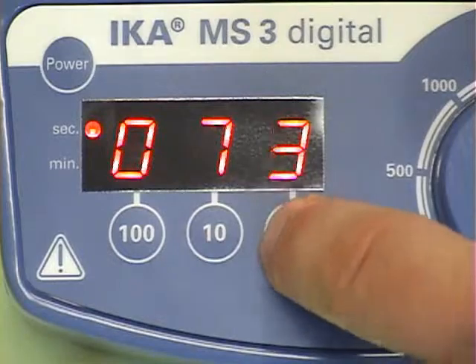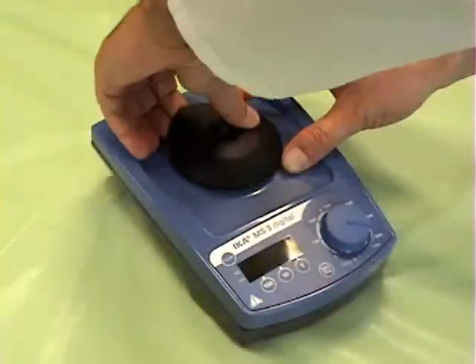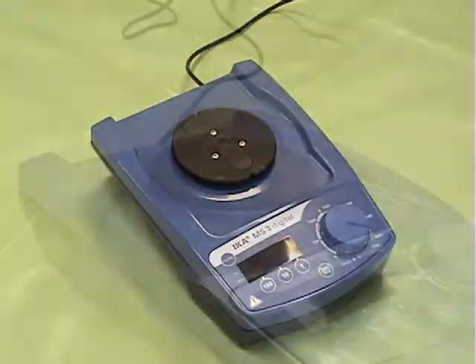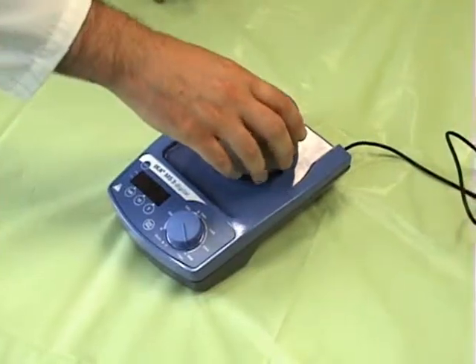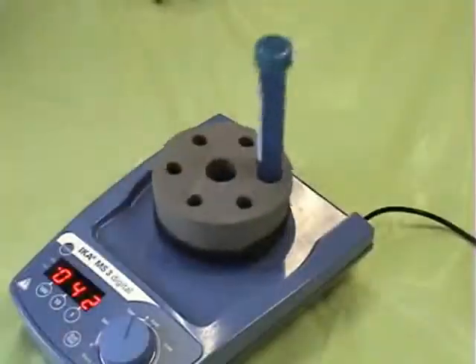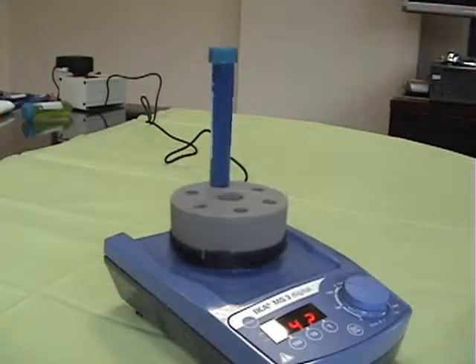Maximum speed is 3000 RPM. A wide range of attachments allow you to shake and vortex different types of vessels and tubes, including 15 milliliter and 50 milliliter conical tubes. A variety of other attachments can be purchased separately.